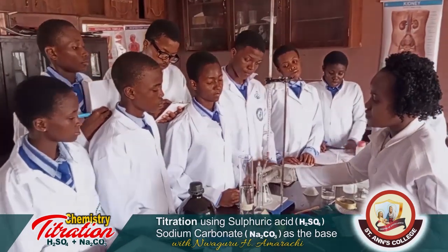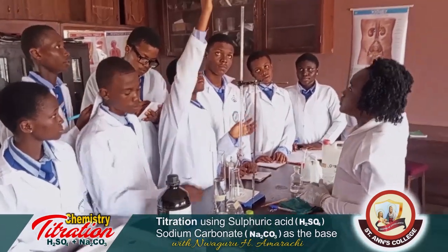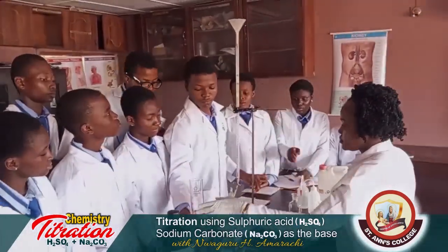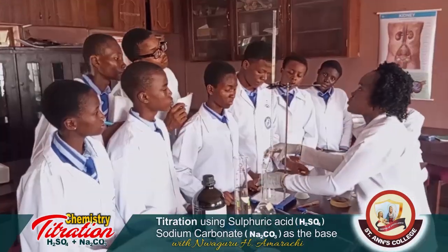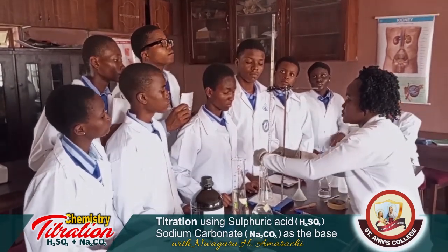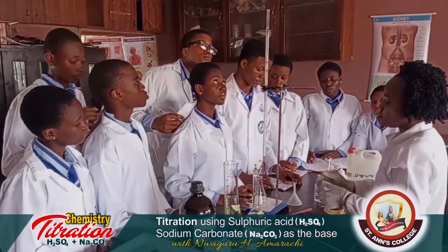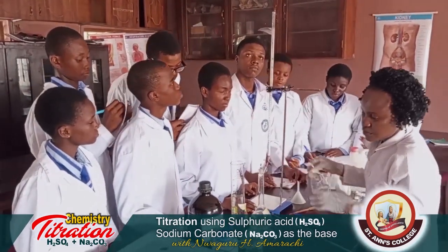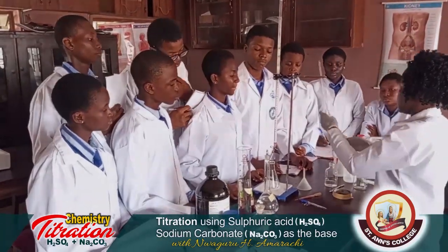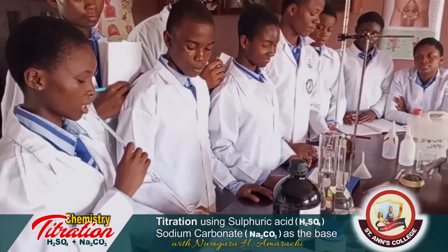Okay, now let's go for our first titration. Fill in our burette again. Of course, we have to check and make sure that it is at the zero value, which is the initial value of the burette. We discard. Then let's get our base.